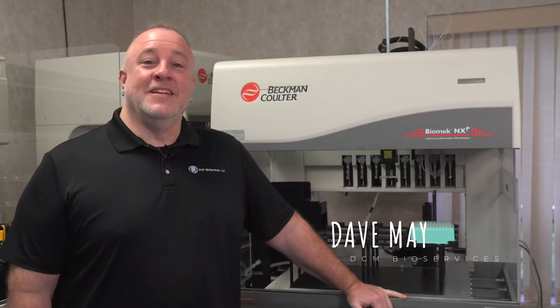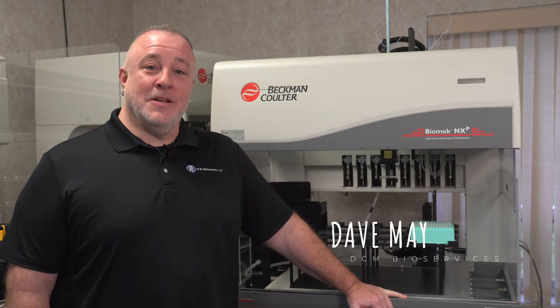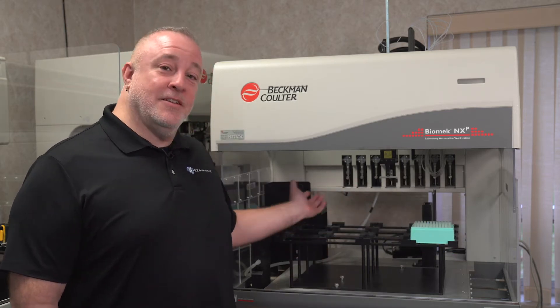Hey everybody, this is Dave from DCMBio. Today I'm going to go over the functionality of the Biomex Span 8 to shuck your tips into a tip box instead of into the trash.